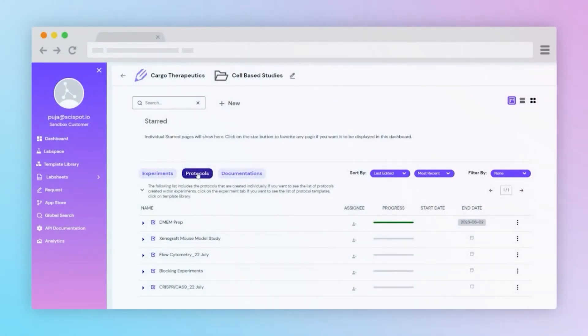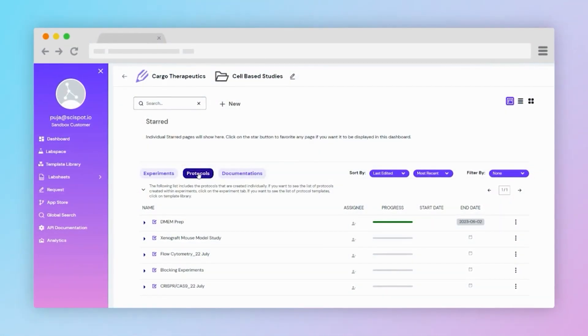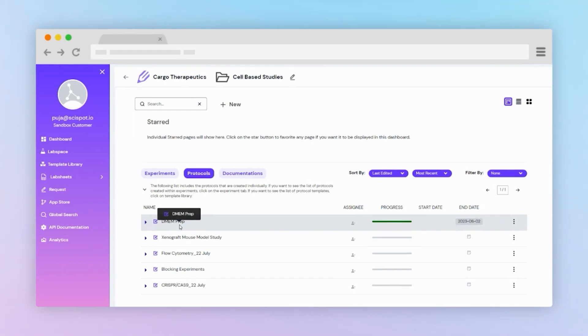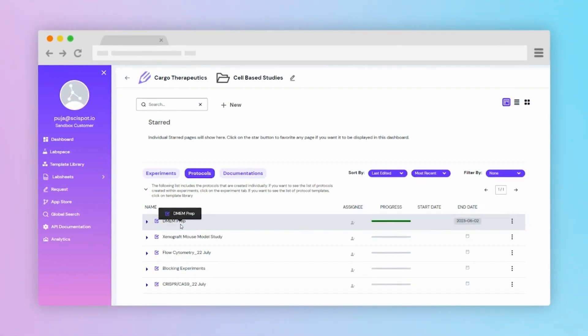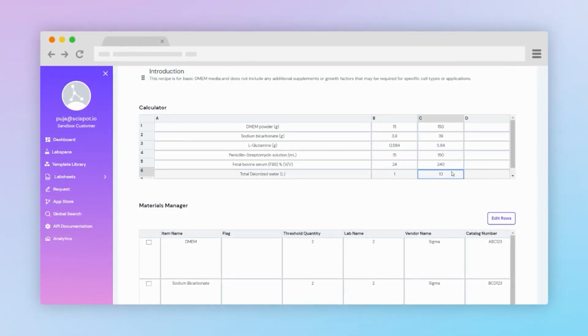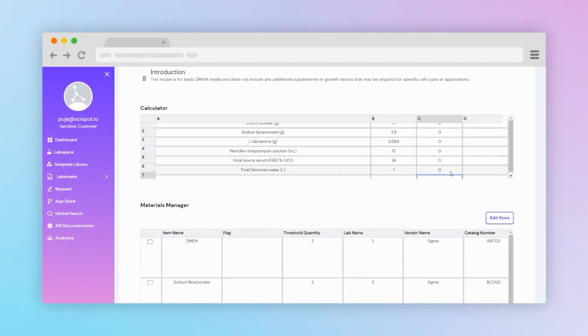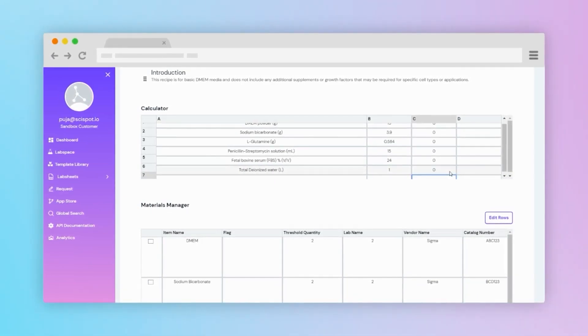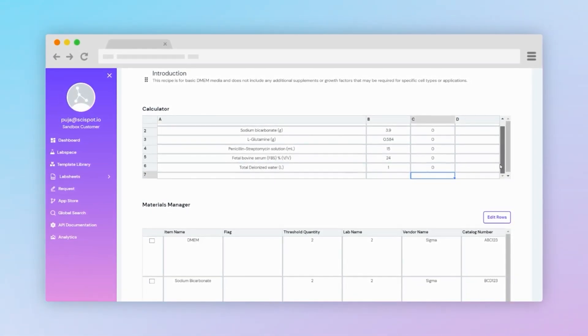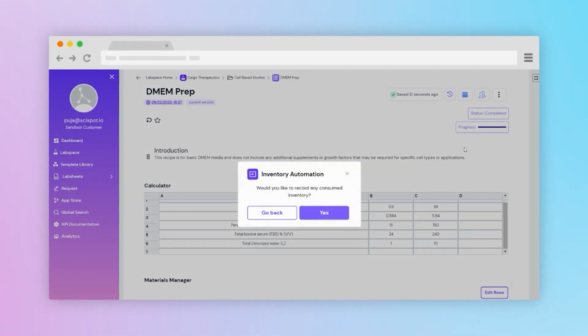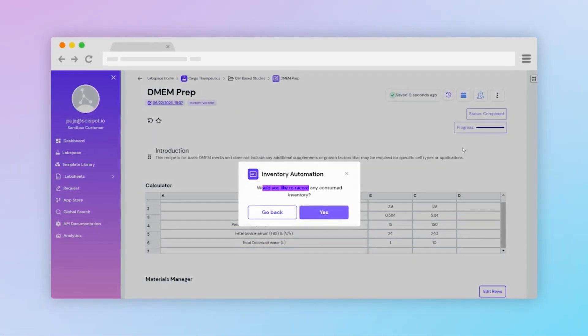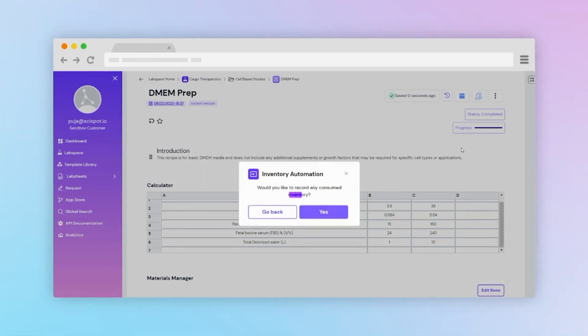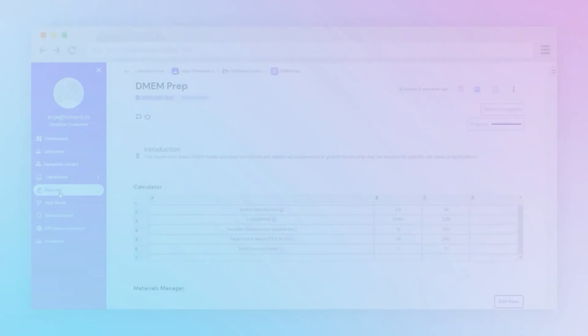If we open a protocol, for example preparation of media, you can create calculated sheets. Calculated sheets facilitate media creation by automatically calculating constituents based on user-defined outputs. Inventory automation can be triggered from the protocol page, which will allow you to subtract consumables from the master inventory data sheet.